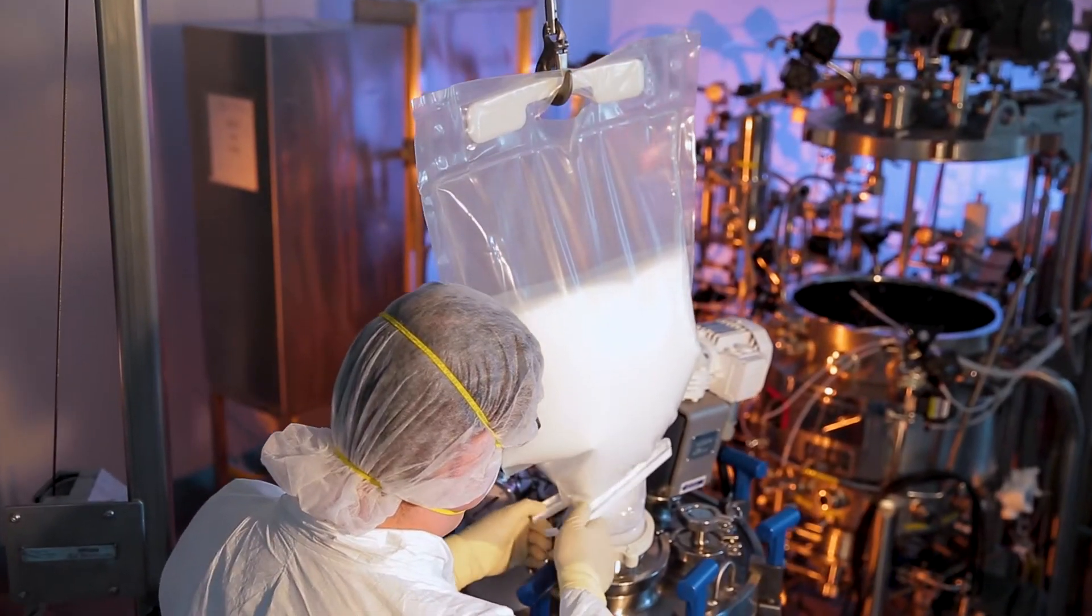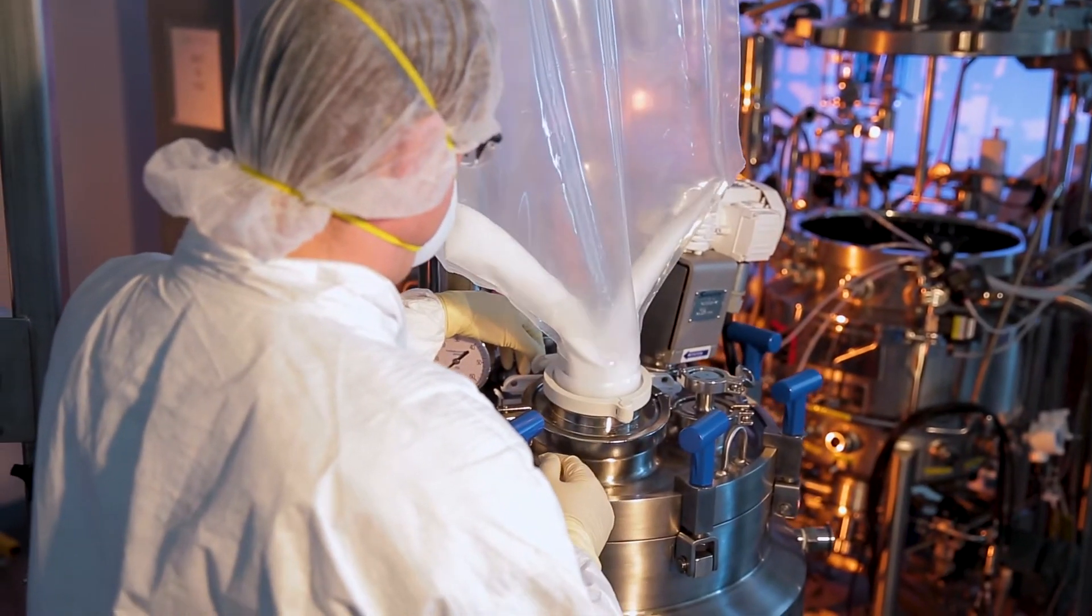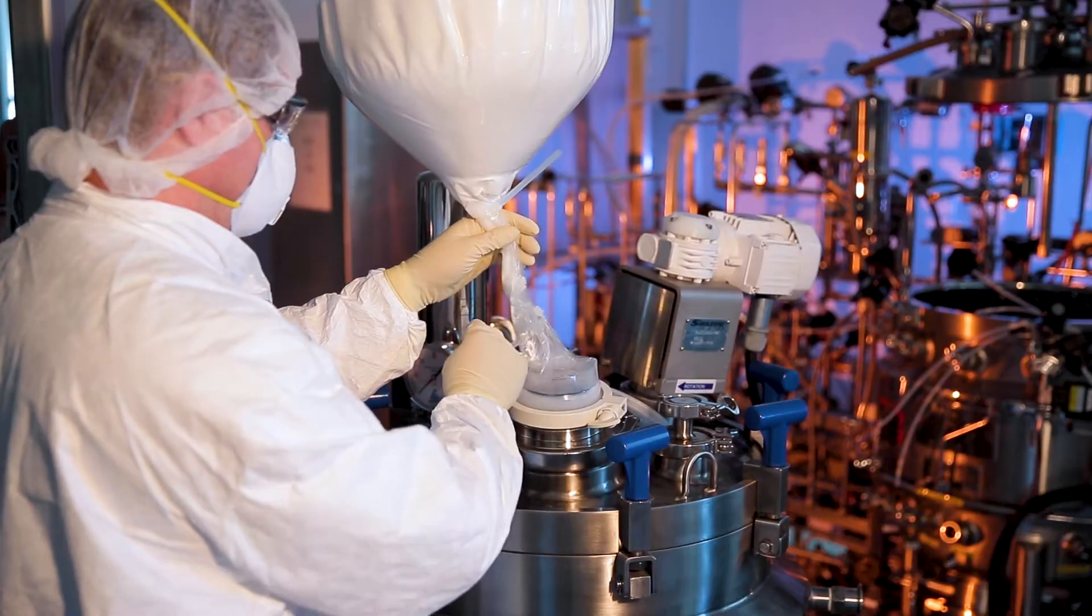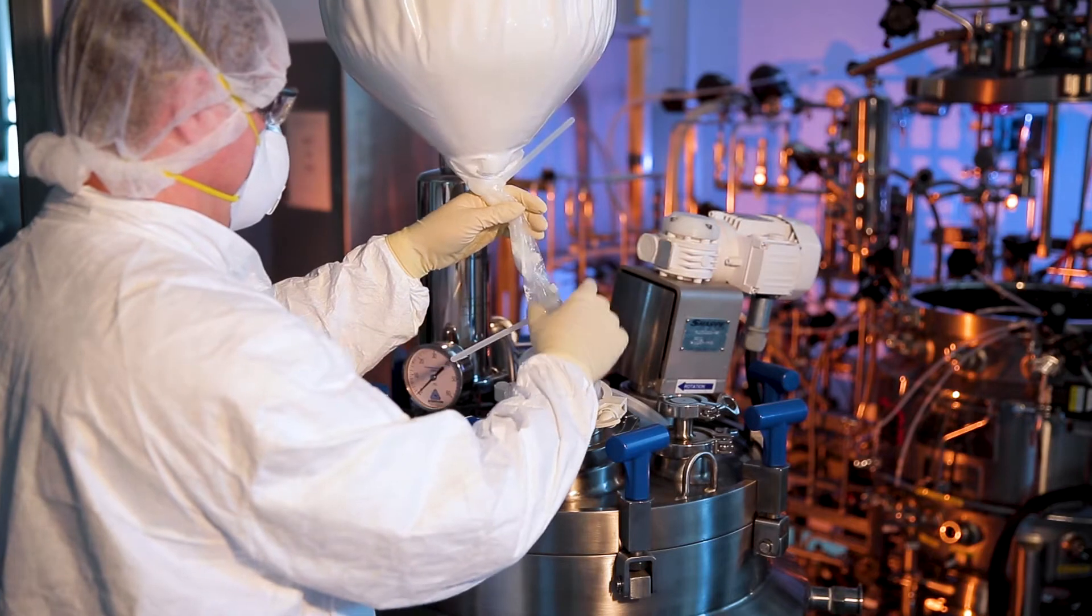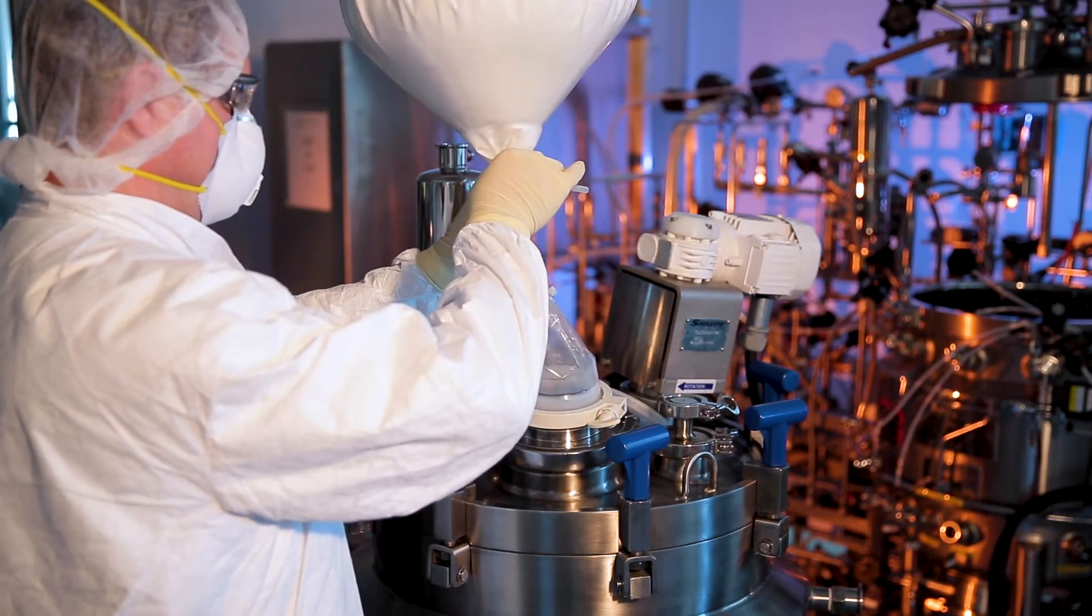Unlike two-dimensional bags, which have only one narrow, pinch-pleated opening for both fill and discharge, EZ-Biopac's three-dimensional bags incorporate a smooth, conical discharge outlet completely separate from the fill opening, so the discharge remains clear, clean, and smooth.